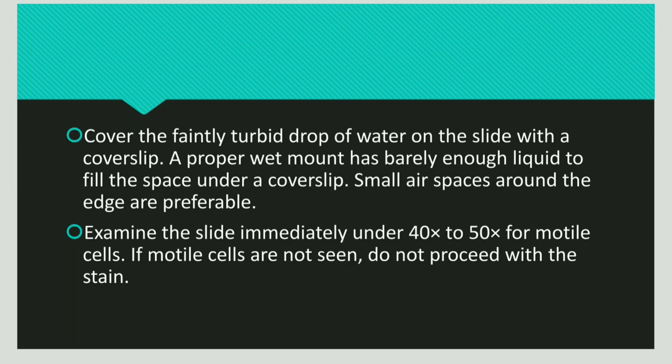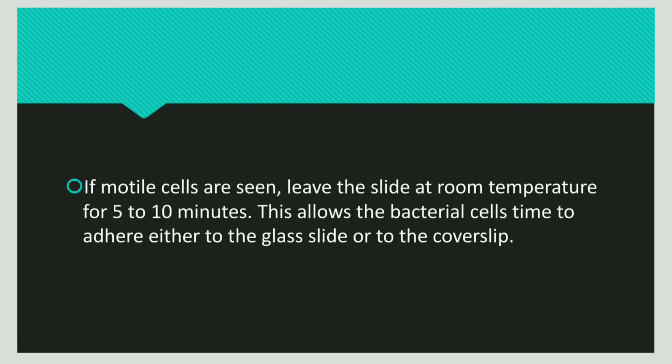Now cover the slide with a cover slip. After covering the slide, immediately view it under a microscope at 40x to 50x. If motile cells are not seen, do not proceed with the staining.